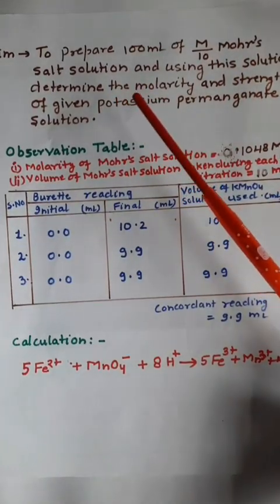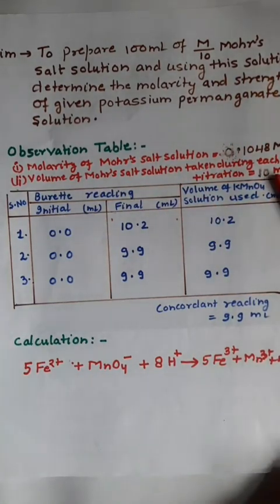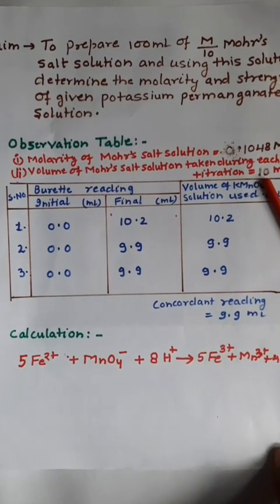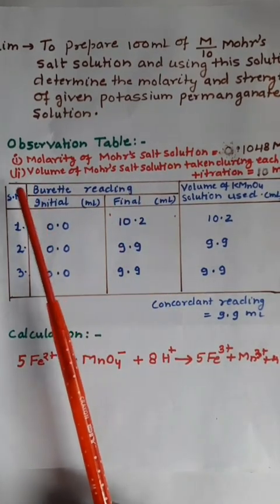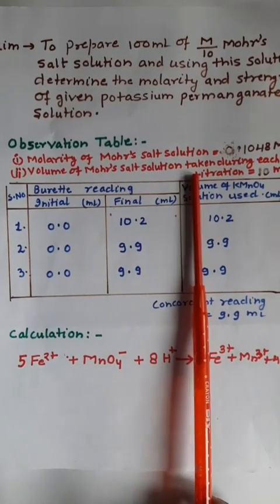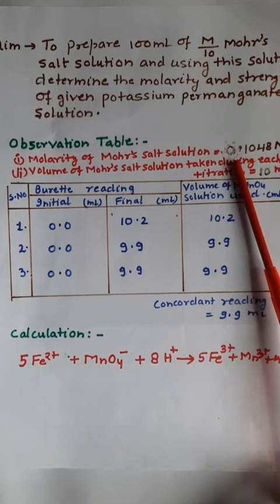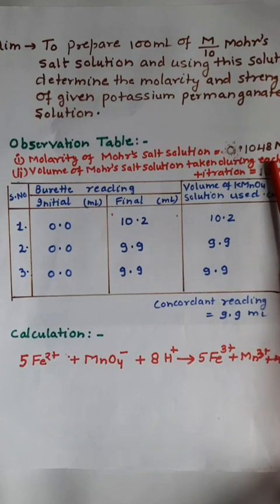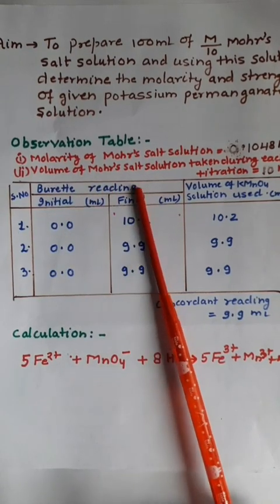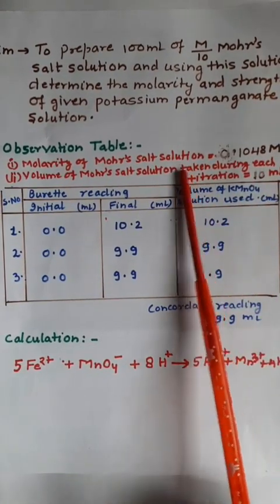Now, the aim of the experiment was to prepare 100 ml of M/10 Mohr salt solution, and using this solution determine the molarity and strength of the given potassium permanganate solution. Next, let us draw the observation table. Before drawing it, you have to report two readings. The first is the molarity of the standard Mohr salt solution prepared, which, as you have seen in the previous video, was 0.1048 moles per liter. The second is the volume of Mohr salt solution taken during each titration, which is 10 ml. You have to report these two readings above the observation table.